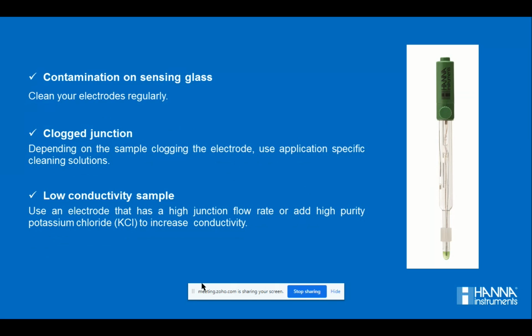Whenever you calibrate a pH electrode, the meter itself assumes that the electrode is clean, and thus it nullifies the error after the calibration accordingly. Thus it is very much necessary that you should have a clean electrode just before calibration.